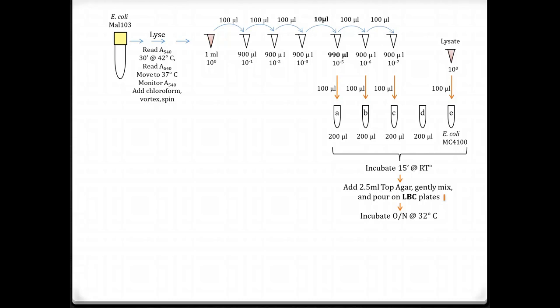You're going to incubate it overnight. It's probably better to look at these later in the day the next day, not early the next morning, so that the plaques have a little bit of time to form. And then you're going to count them.